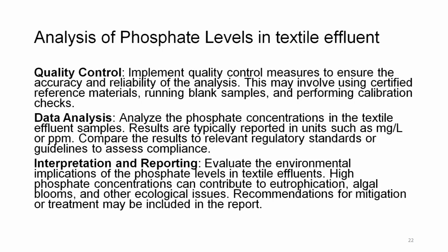Quality control. Implement quality control measures to ensure the accuracy and reliability of the analysis. This may involve using certified reference material, running blank samples and performing calibration checks.